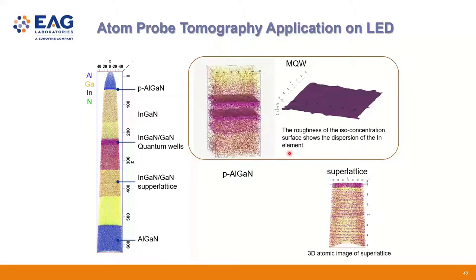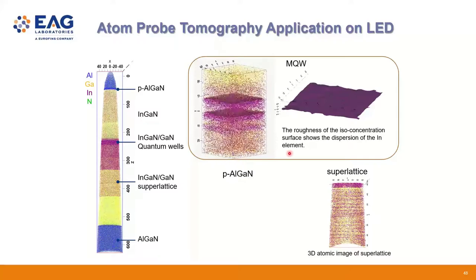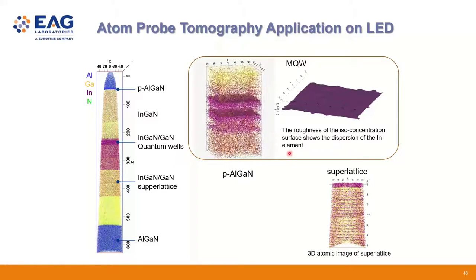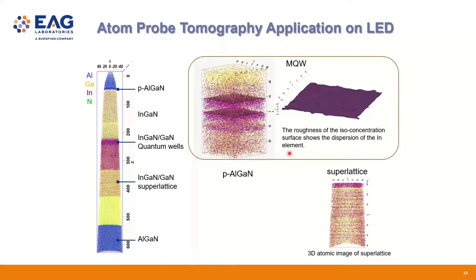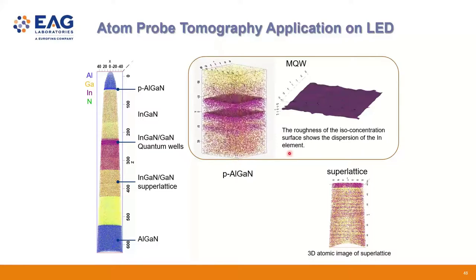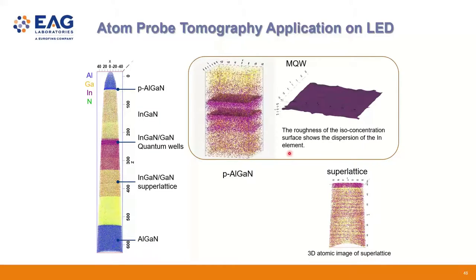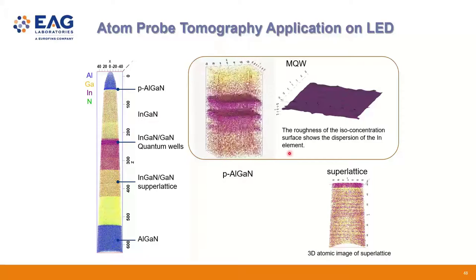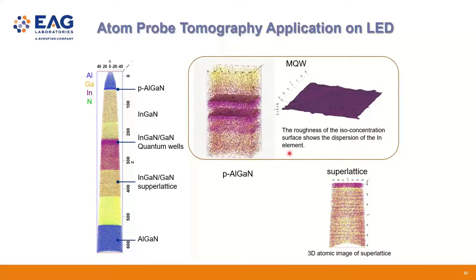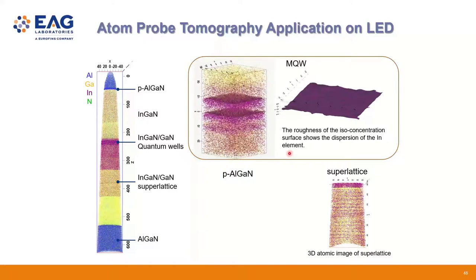All the techniques have their own limitations, right? Including EELS. That's why, if you go to an analytical lab as a process engineer, you always want to have a problem statement. You don't just want to say, oh, I want to go to EELS. Sometimes EELS is probably not the best for your problem. You want to always select the right technique to solve your problem.